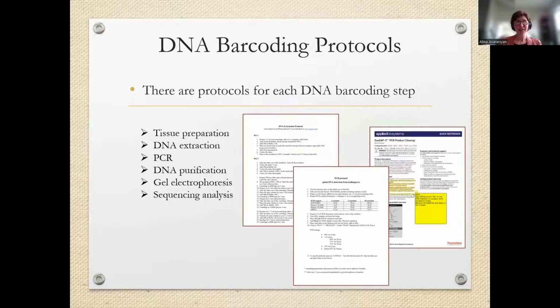Over the past several years, we developed the protocols for each DNA barcoding step. It's very important to follow these protocols to make sure you always add the right amount of the right reagent.